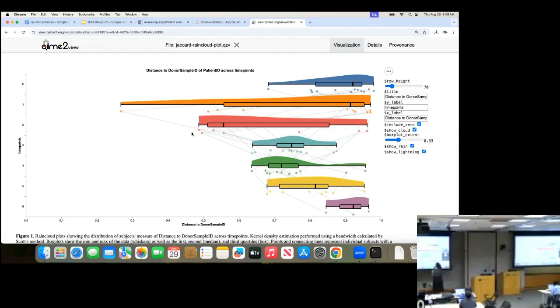Okay, so our 0 time point. Does anyone remember what nomenclature I used to describe that? Yeah, we call that our baseline. So blue, our beautiful blue rain cloud, that is our baseline rain cloud. And then 1 and 2 are time points. Well, actually 0 is 2, but we don't have to talk about that.